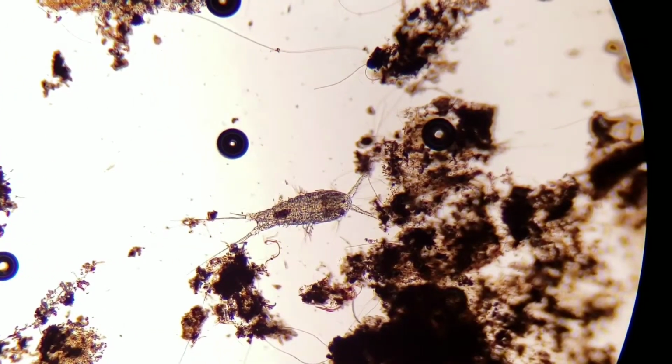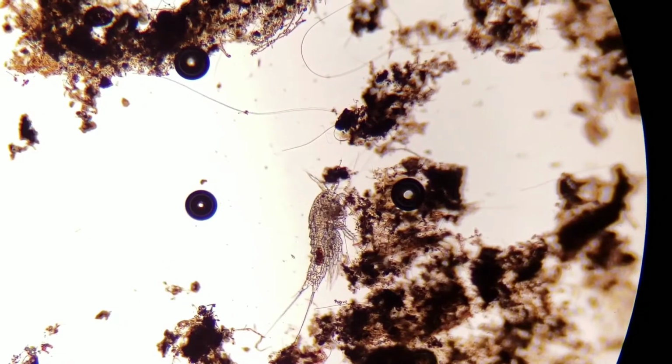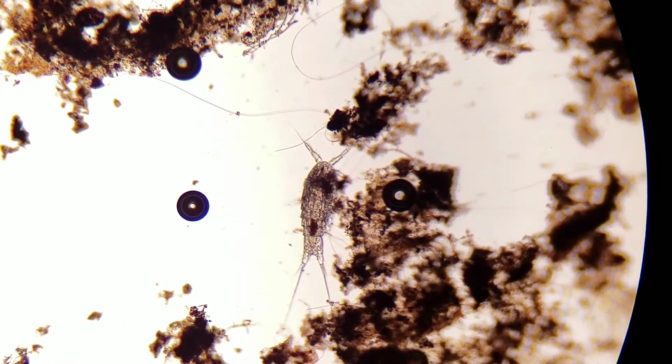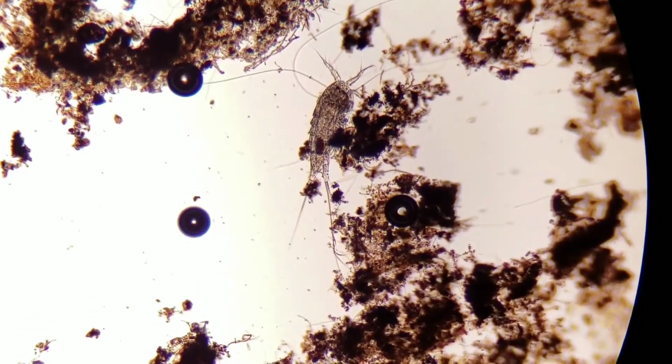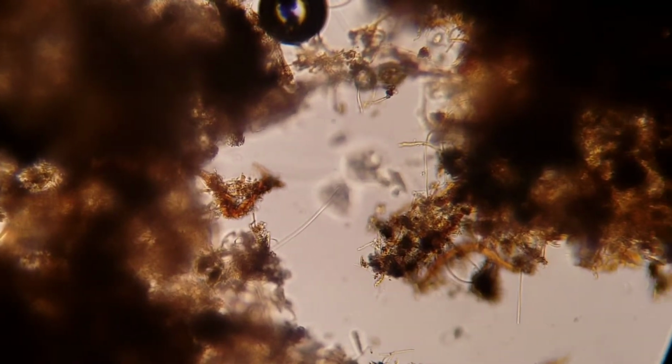So yeah, they have a little red eye in the middle of their forehead. And they carry their egg sacs kind of like a lobster on the outside and two sacs on each side of those long tentacles sticking out his rear. Those will be full of eggs. What have we here?